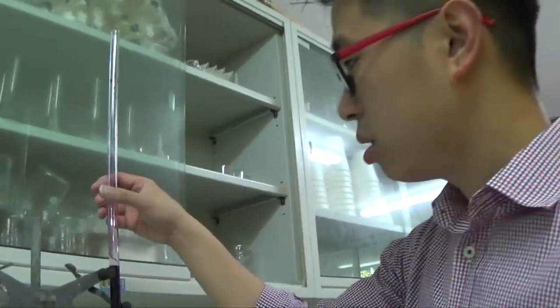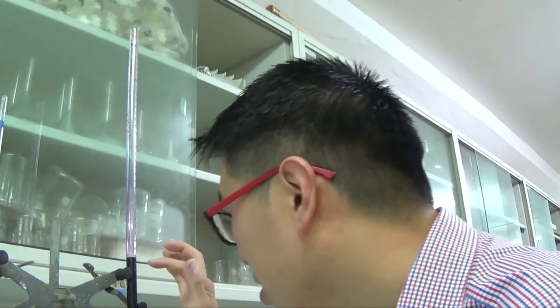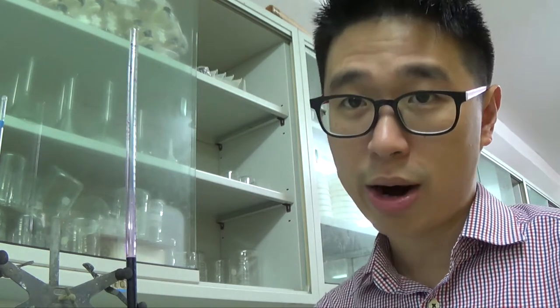Okay, so on my burette reading, again, I will read above the meniscus. So that is 26.9. So 26.90 minus 2.70. 26.90 minus 2.70. That will be your volume or rough titer.